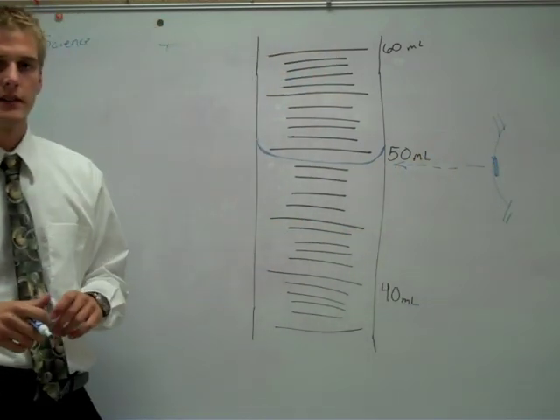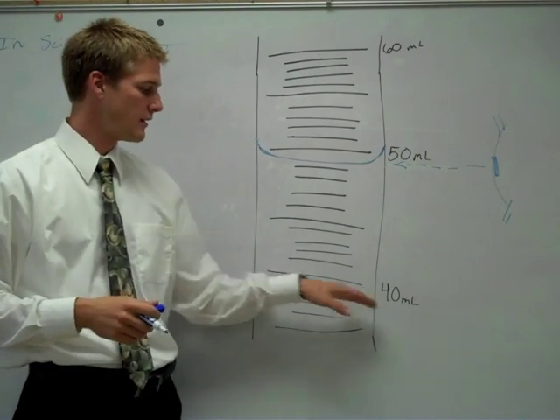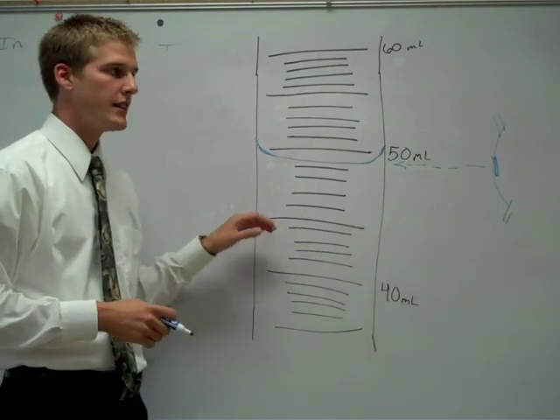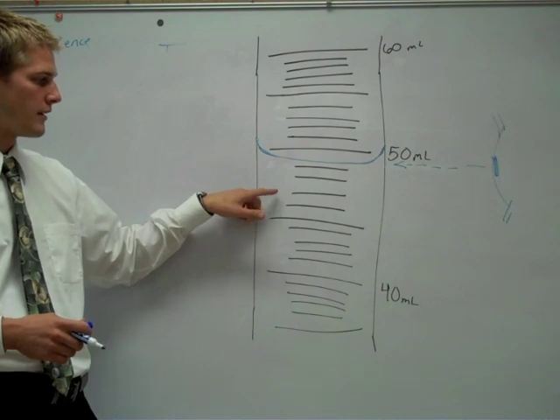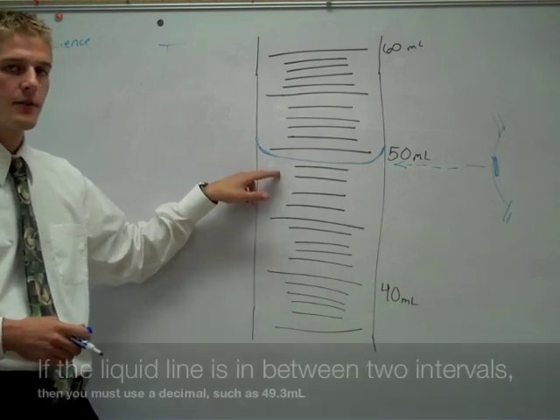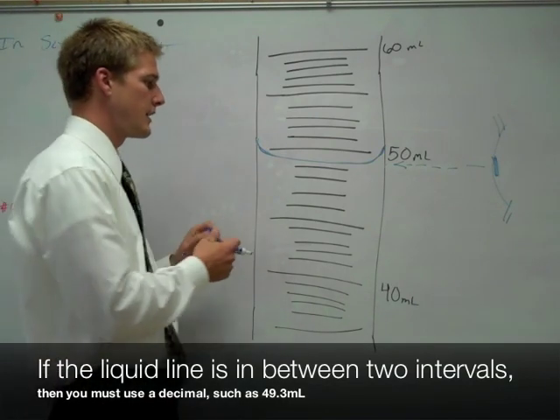When you read this, you know that the 40 is here. You go up five lines. 45, then you count individual graduations. 41, or 46, 47, 48, 49. 49 is right here.